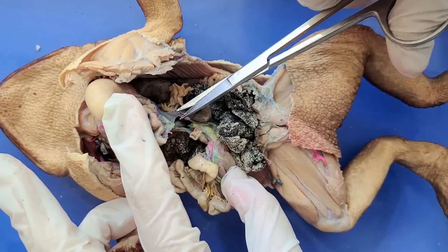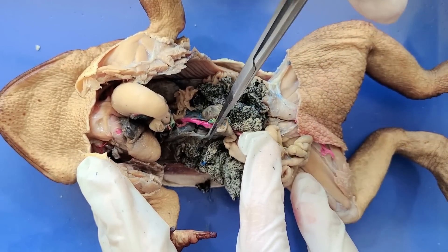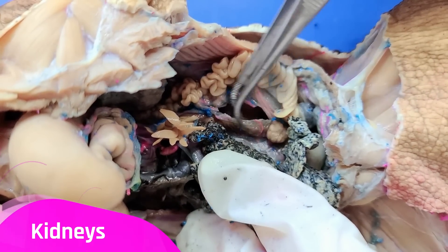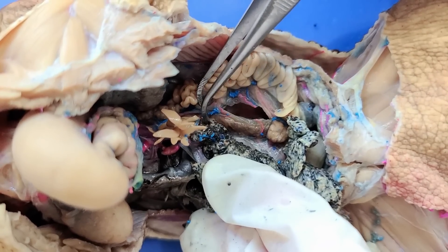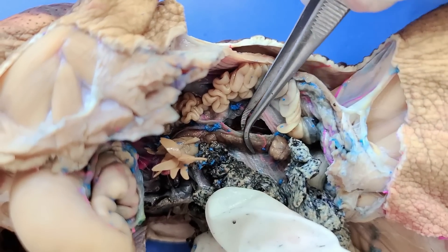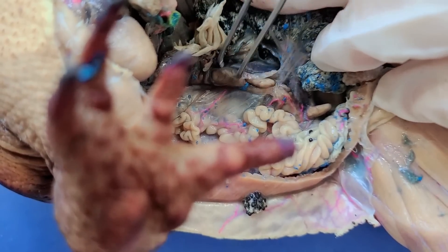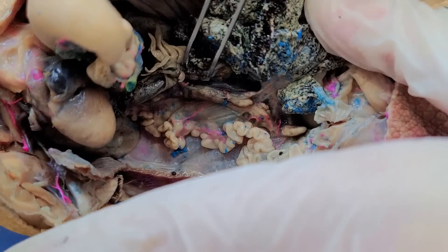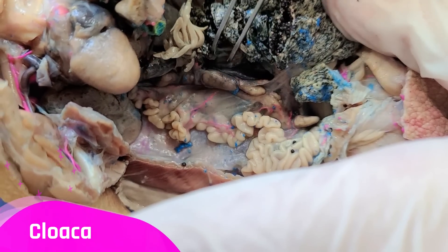Now I'll cut between the stomach and the intestine. So now you can see the toad's kidneys — this long, dark structure here. It's not bean-shaped like it is in humans. You can also see another one on the other side. The kidneys filter the blood and produce urine, which is then excreted through the cloaca.